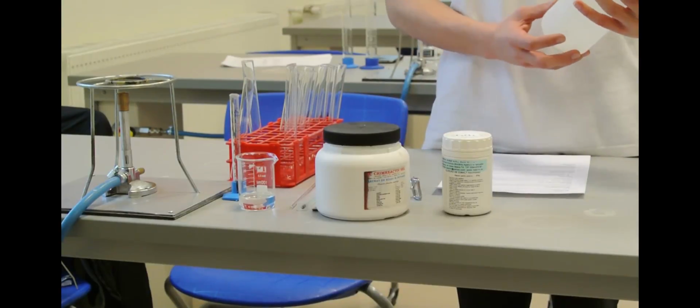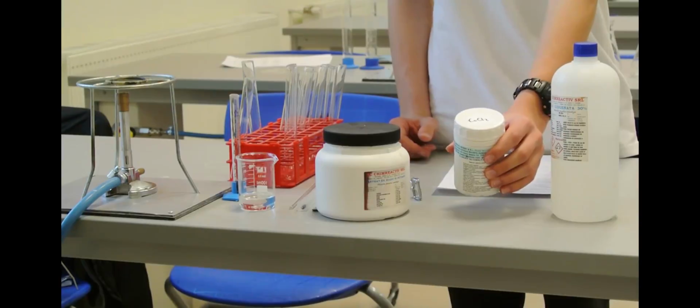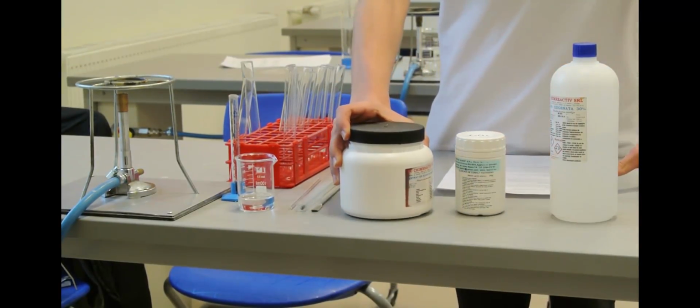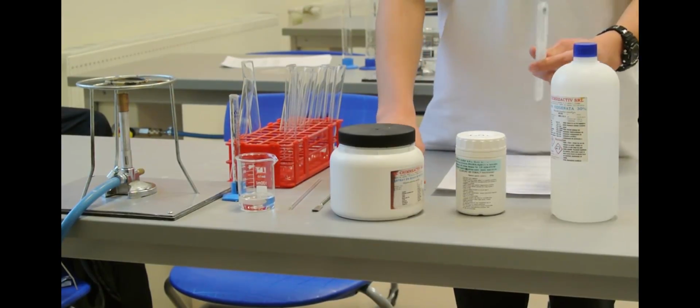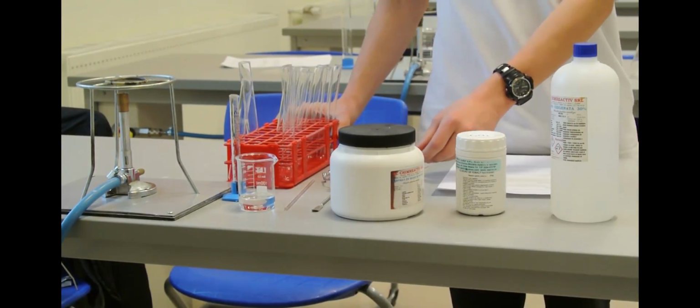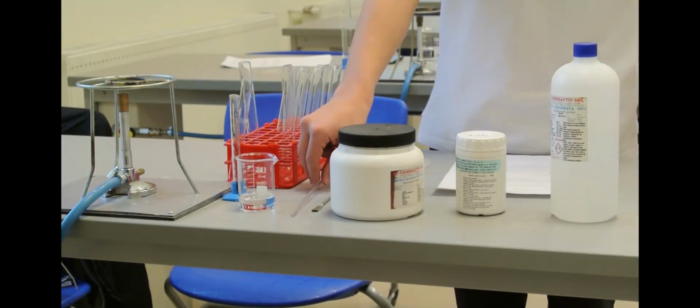So for this experiment I'll need hydrogen peroxide, cobalt chloride and sodium potassium tartrate for my chemicals. Also I'll need a thermometer, a test tube holder, test tubes, a stirring rod and the Bunsen burner.